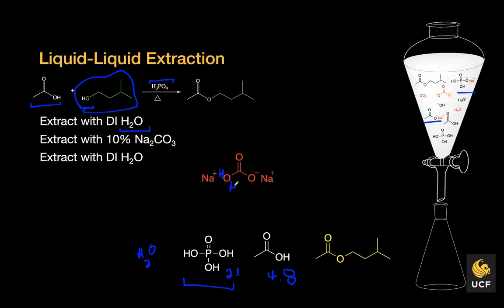It would protonate again from the protons in solution. It would end up having a positive charge. What would happen then? It could be an excellent leaving group, right? And then this oxygen would go in and form a double bond, and that's how carbon dioxide is generated in the solution. And if you watch the video, you could clearly see carbon dioxide gas evolving, and that's just because of the reaction of sodium carbonate.